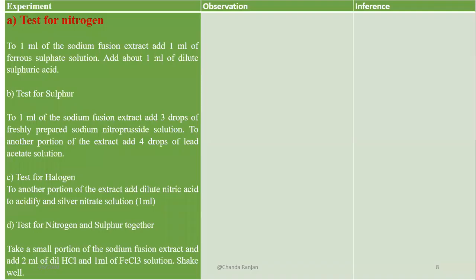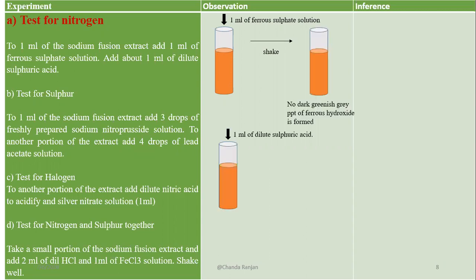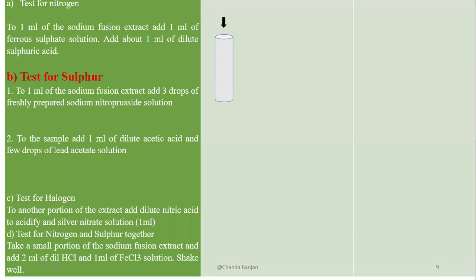We take the sodium fusion extract and start with the test for nitrogen. We add 1 ml of ferrous sulfate solution, shake it, and note that a greenish-grey precipitate of ferrous hydroxide is formed. Then we add 1 ml of dilute sulfuric acid and heat it. No formation of Prussian blue precipitate is observed, so all tests are negative — nitrogen is absent.